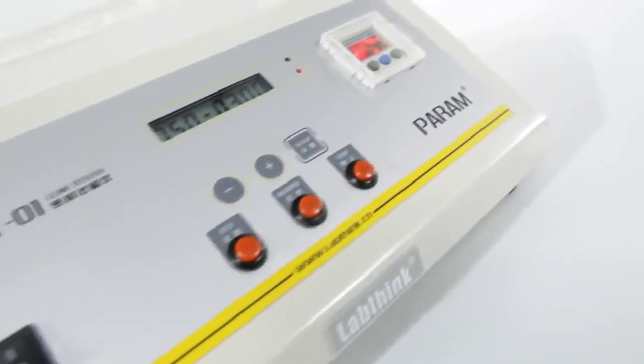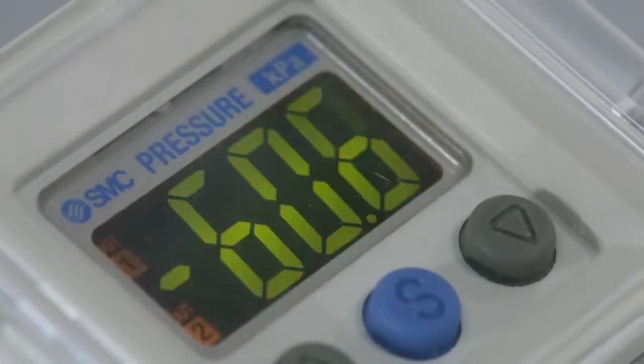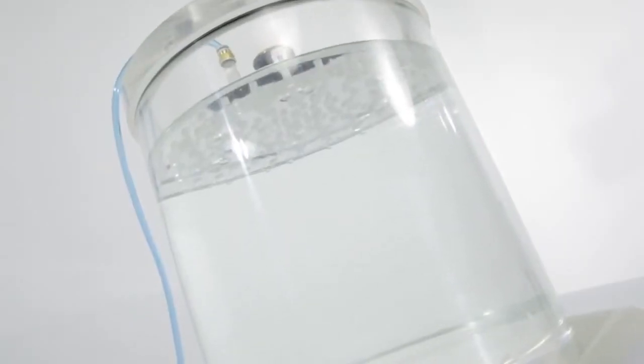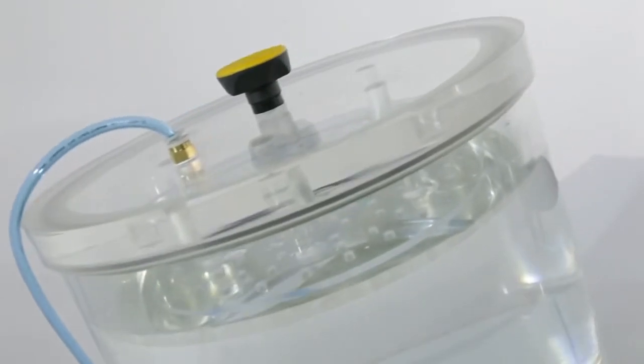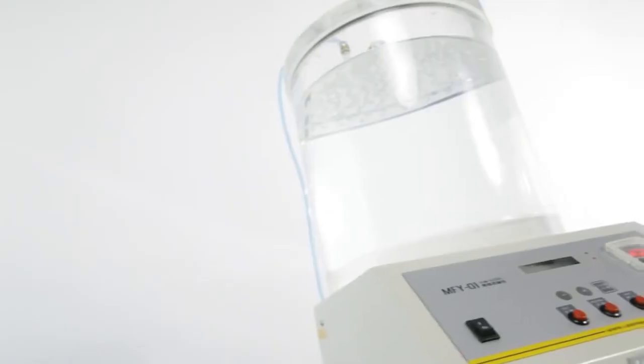This instrument allows presetting of vacuum degree and vacuum retention time. Test termination and air back flush functions make the entire testing process totally automatic and reliable.